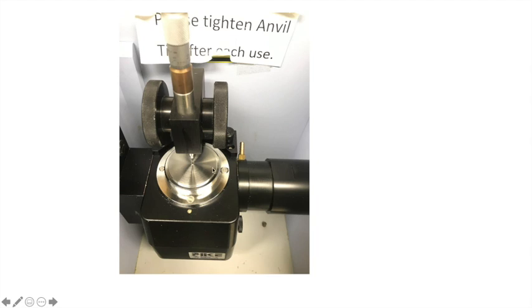So we'll come over to our IR, and remember we have our ATR adapter, attenuated total reflectance. Remember how that works? The IR light comes in and hits a mirror. It's in this black box, and it bounces up into a zinc selenide crystal, and that's that little gold peak there you'll see. That's like the tip of the iceberg. Underneath the metal there's zinc selenide, and the infrared light bounces through there, ding, ding, ding, ding, and it does total reflectance, like a fiber optic cable kind of.